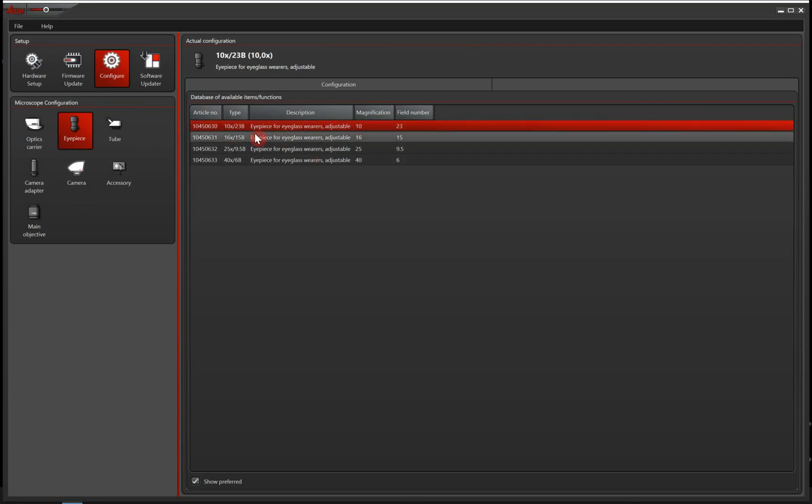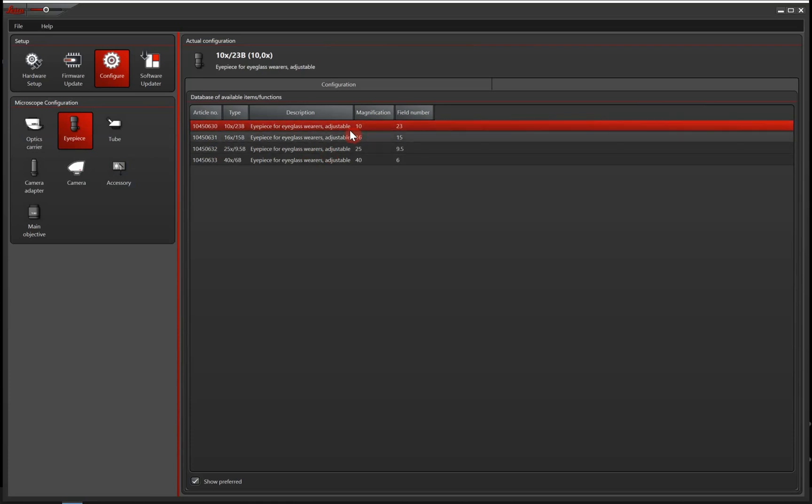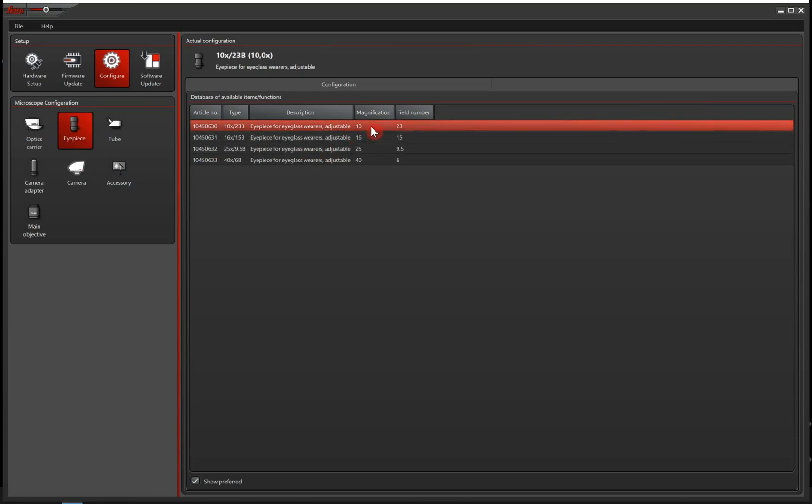So if you don't find your exact article number here, you are fine if you choose a part number which has the same magnification power.